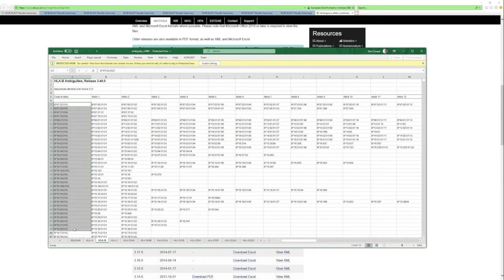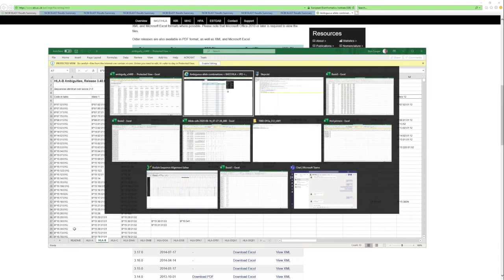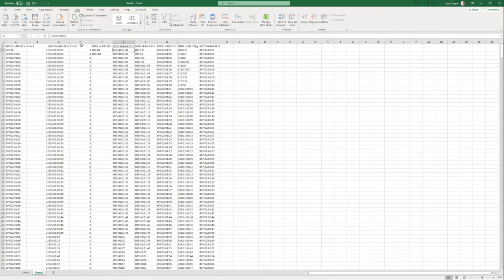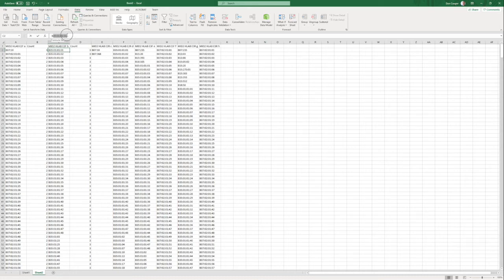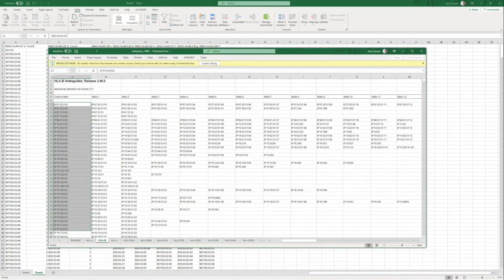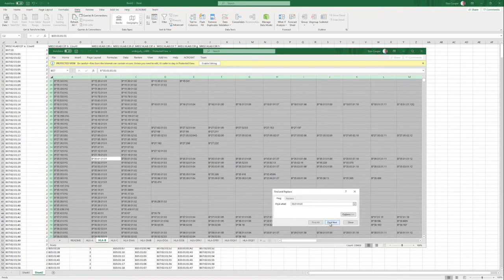Everything always takes twice as long when you're videoing it. It starts off with a read me sheet, which I'll leave to you to read if you're interested. But we're interested in HLA-B. So if I click on the HLA-B tab, you can see that here are the HLA-B groups. There's a whole lot of them. And what we want to do is find where our potential alleles lie. So our potential alleles, we had 35, 0, 1, 0, sorry here. We have 35, 0, 1, 0, 1, 0, 1. So if I just copy that and search for it in here.